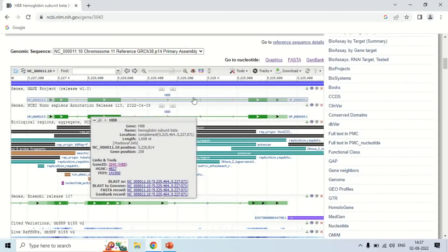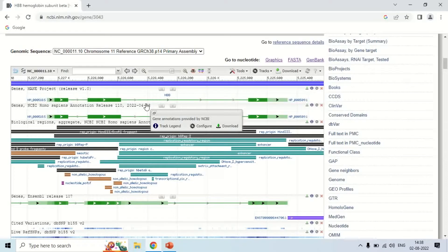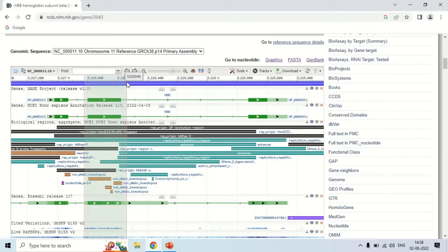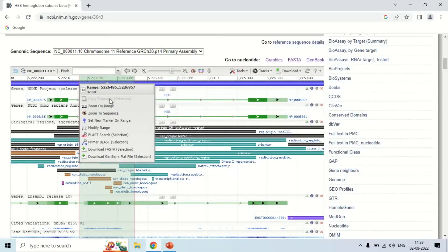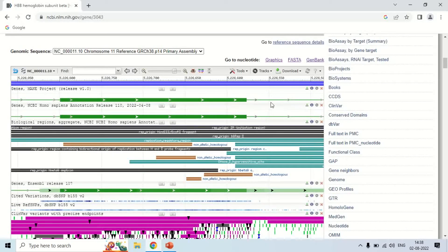For example, if you want to amplify the second exon by PCR, you have to design a primer that will amplify that second exon. To do this, first zoom in: place your cursor, click and select the portion you want. Then right-click and choose the option 'Zoom on range.' Now you can see the second exon is zoomed in.